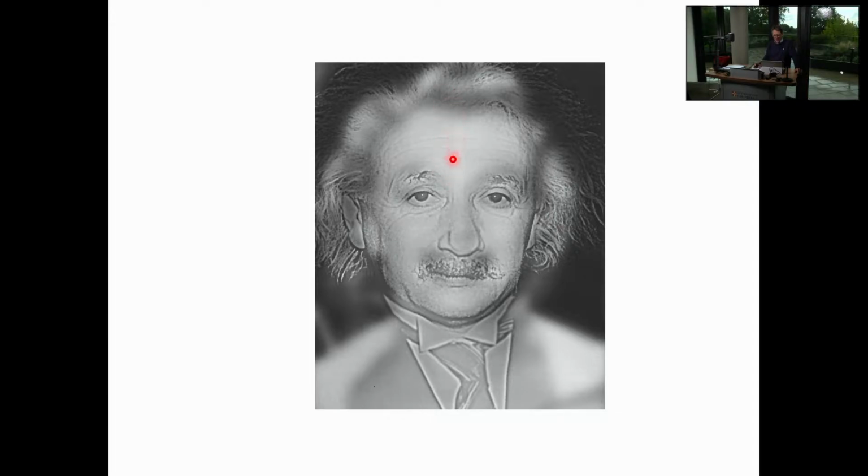Perhaps it changes once per every centimeter or so. Again, you have high spatial frequency down here where the moustache is, and so on. And of course, what the microscope does, because it has a limited optical transfer function, not all spatial frequencies are passed through the instrument, so high spatial frequency content is lost.